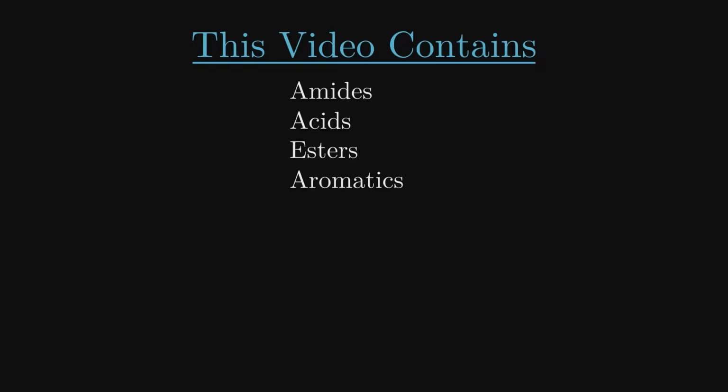Consider each of these 4 a kind of quick hit, as some of the particulars may have been mentioned in a previous video by this point. The last spectra is a practice courtesy of Reddit.